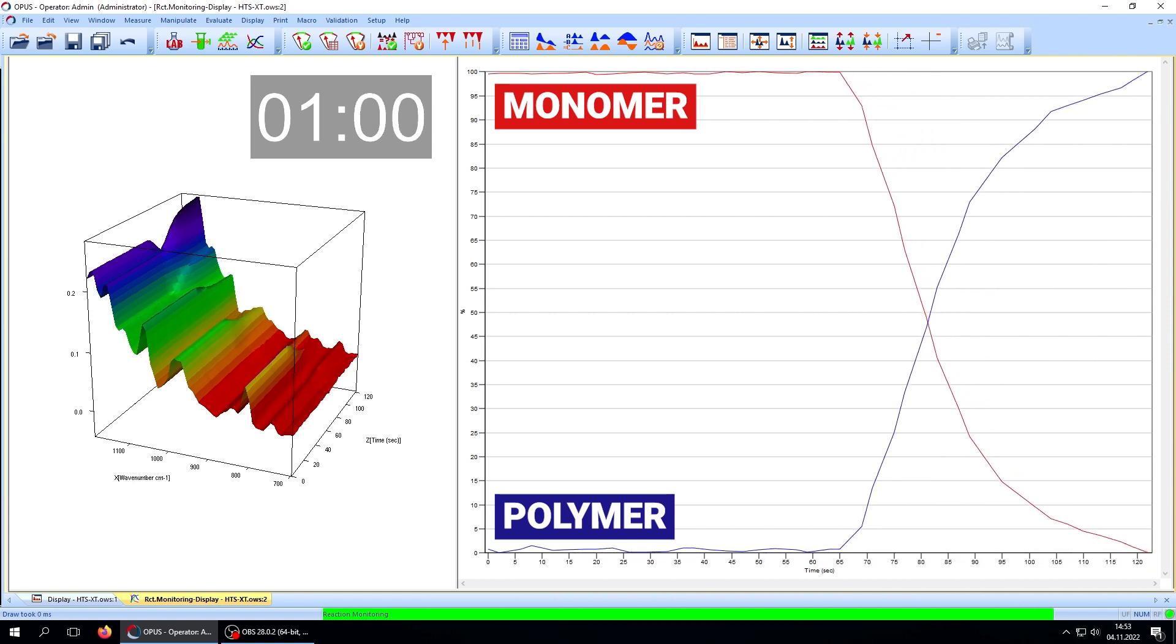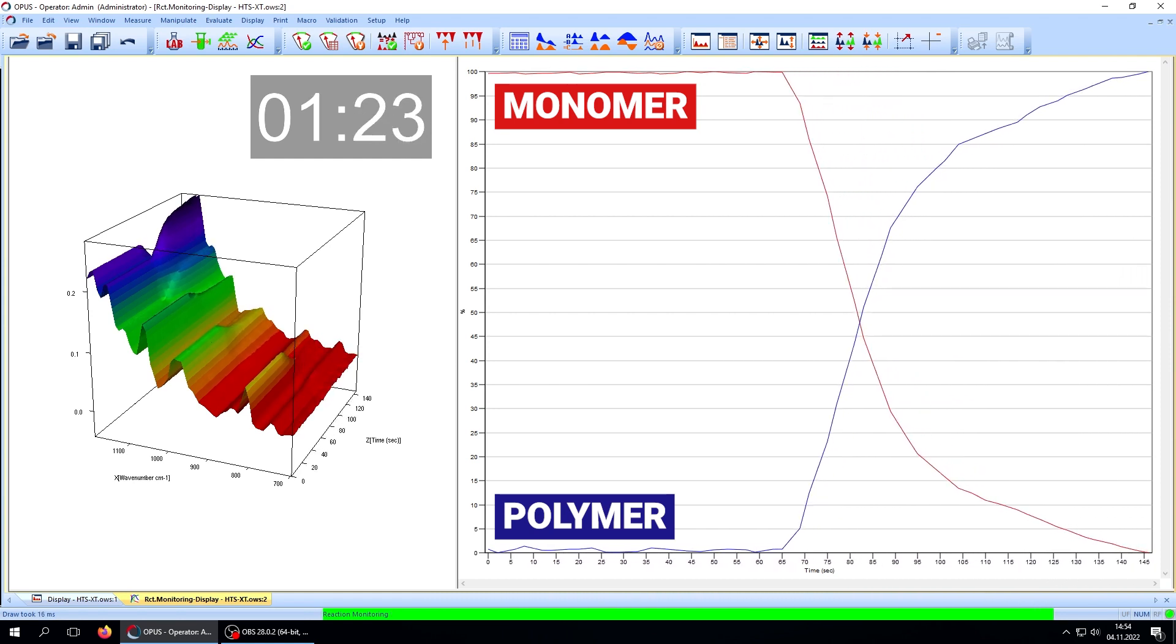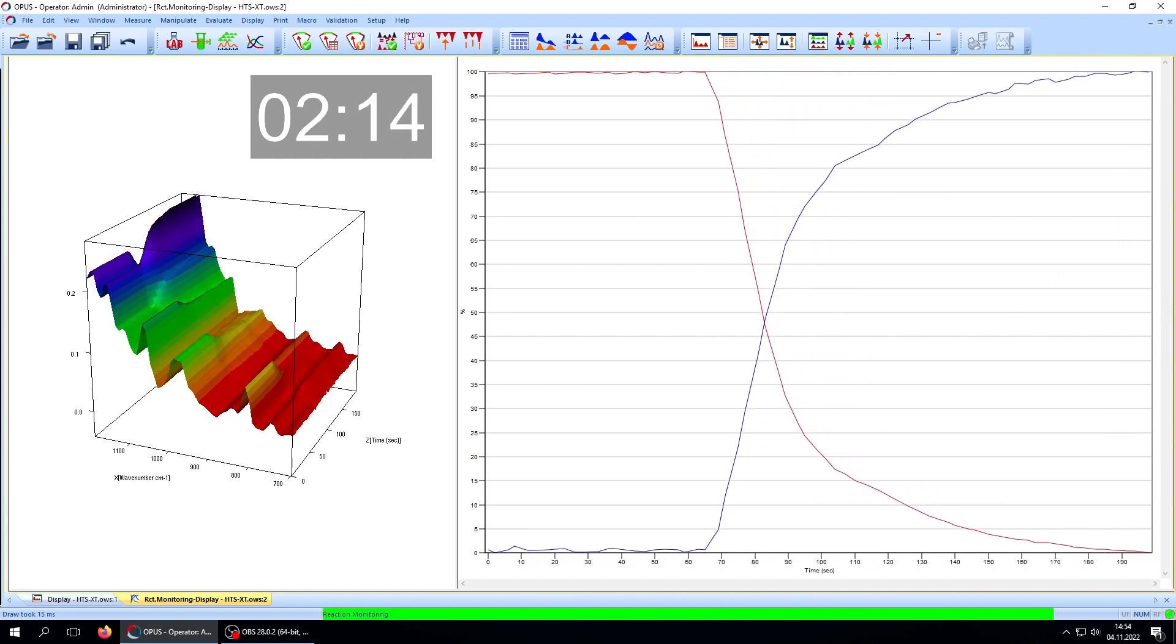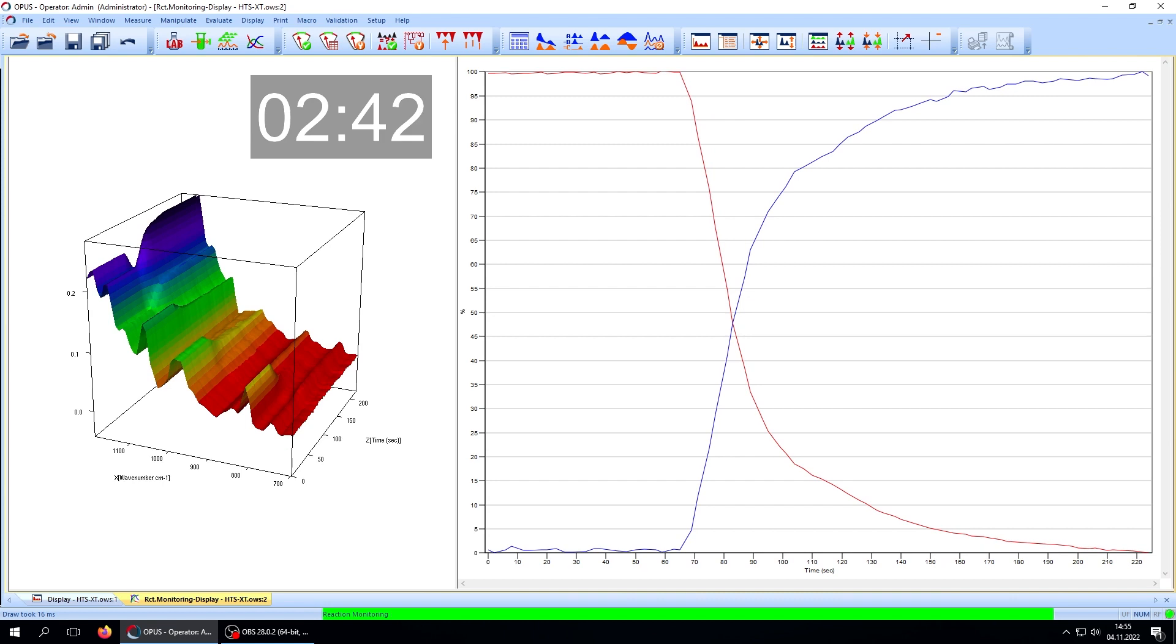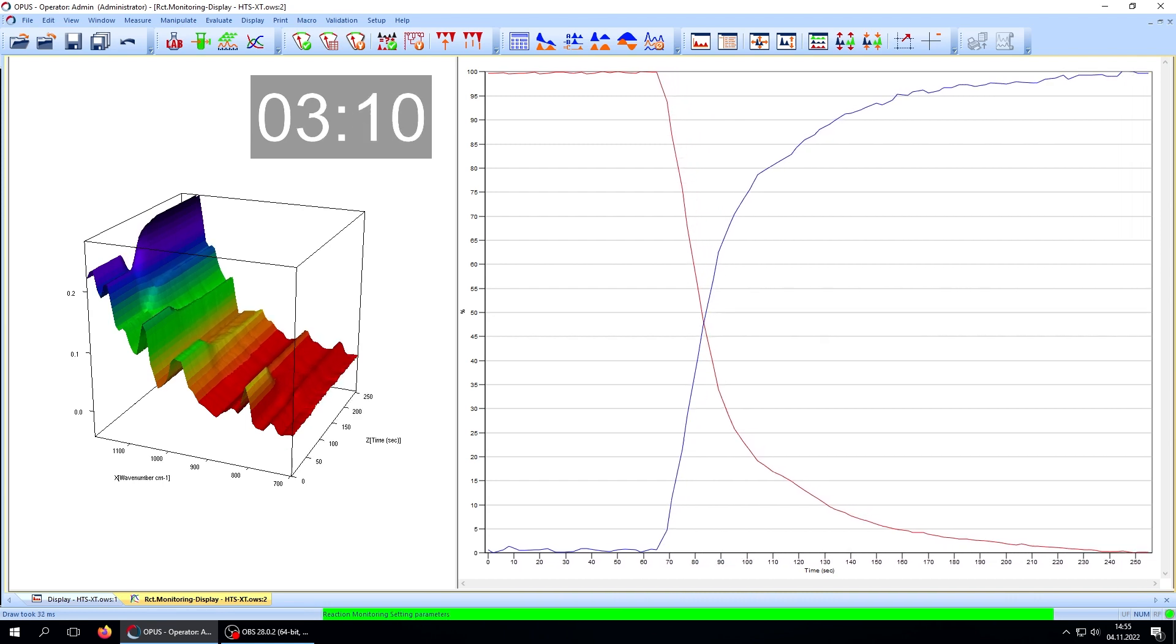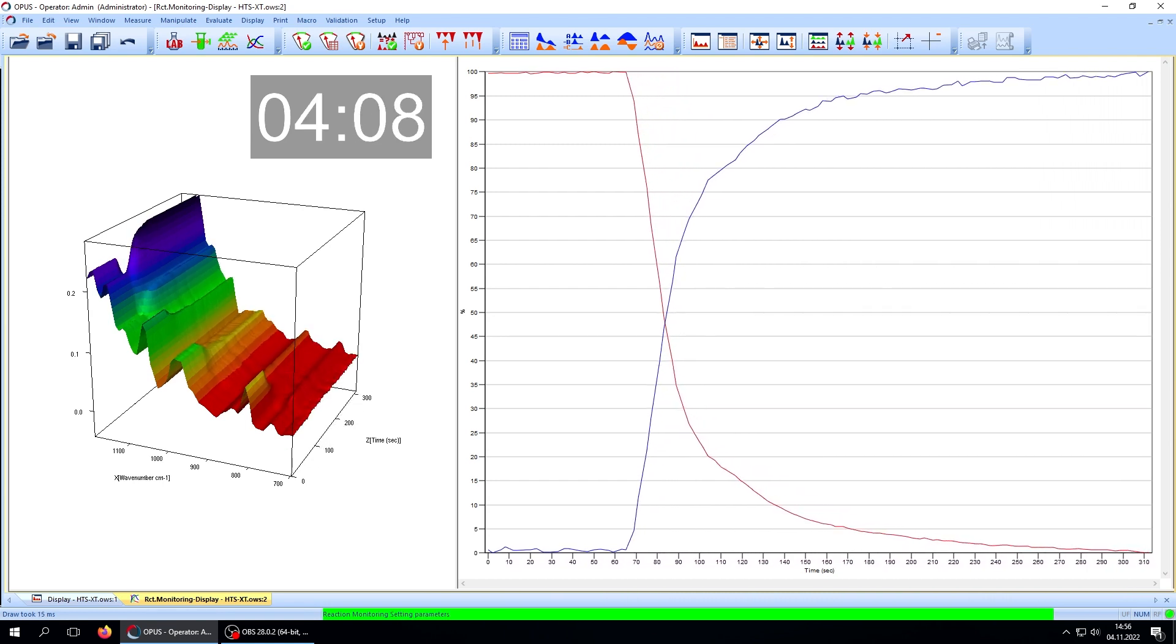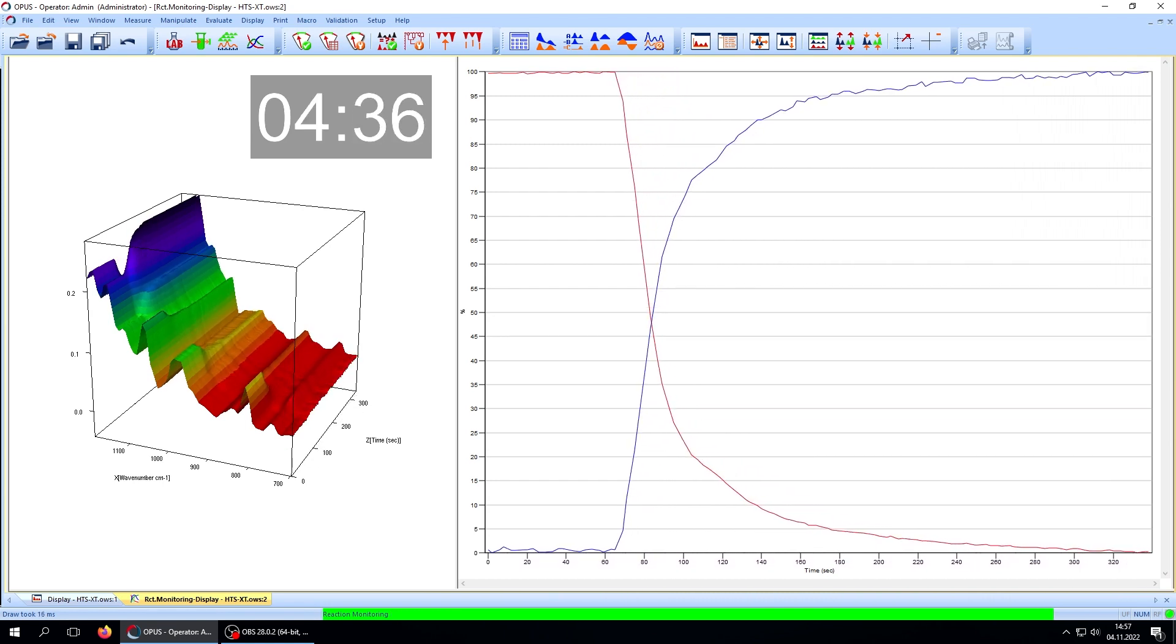For this application, a measurement rate of 1 spectrum per second is enough. However, the Invenio can go up to 70 spectra per second for faster reactions.